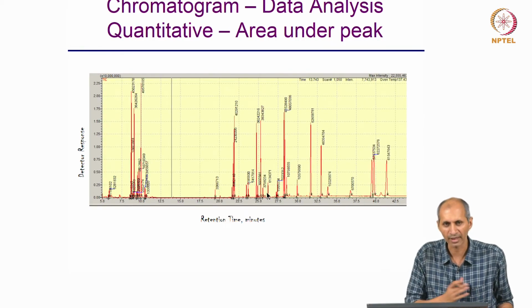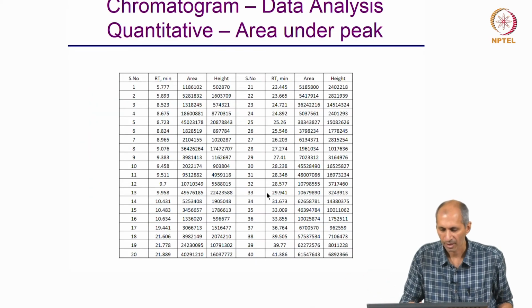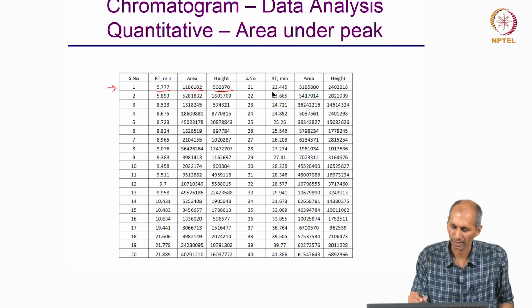So, you can integrate the entire chromatogram, you will get all of these. So, I can get a report like this. It also reports, for a particular retention time, the area and the height, okay.